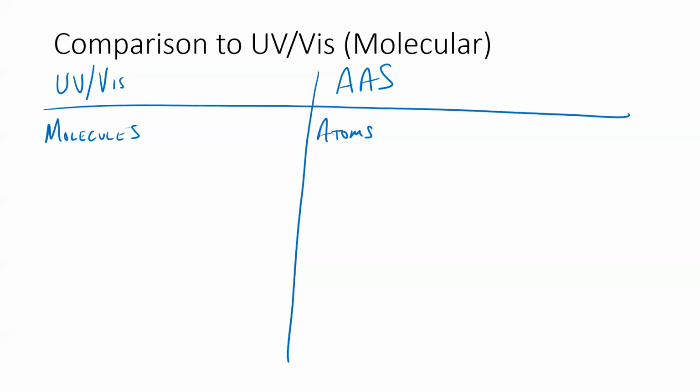On the other hand, because we can't see those very well, it's nice for us to be able to disregard those. If we're looking for impurities in an organic compound, we can disregard copper and all that stuff. UV-Vis can be quantitative or qualitative.